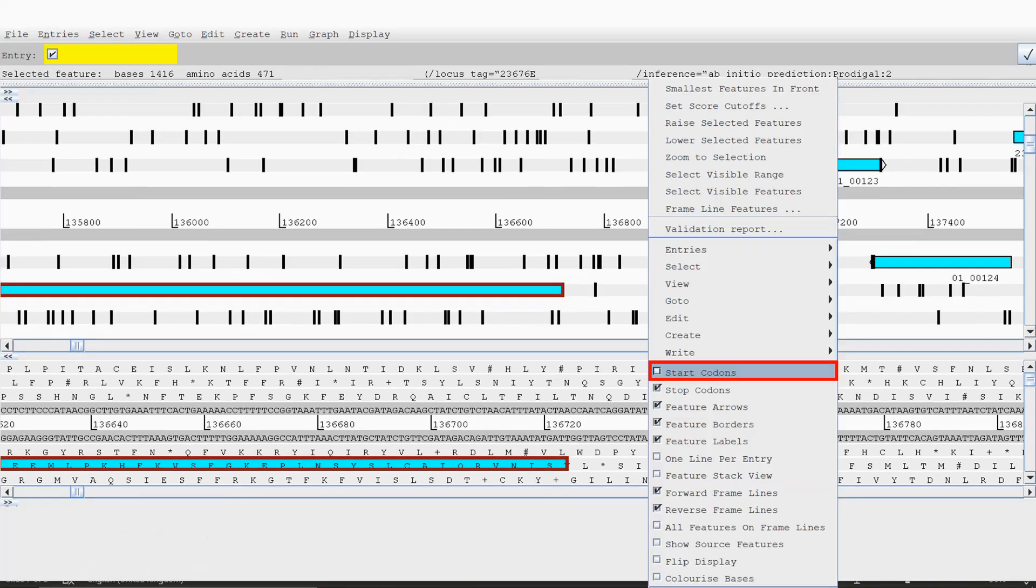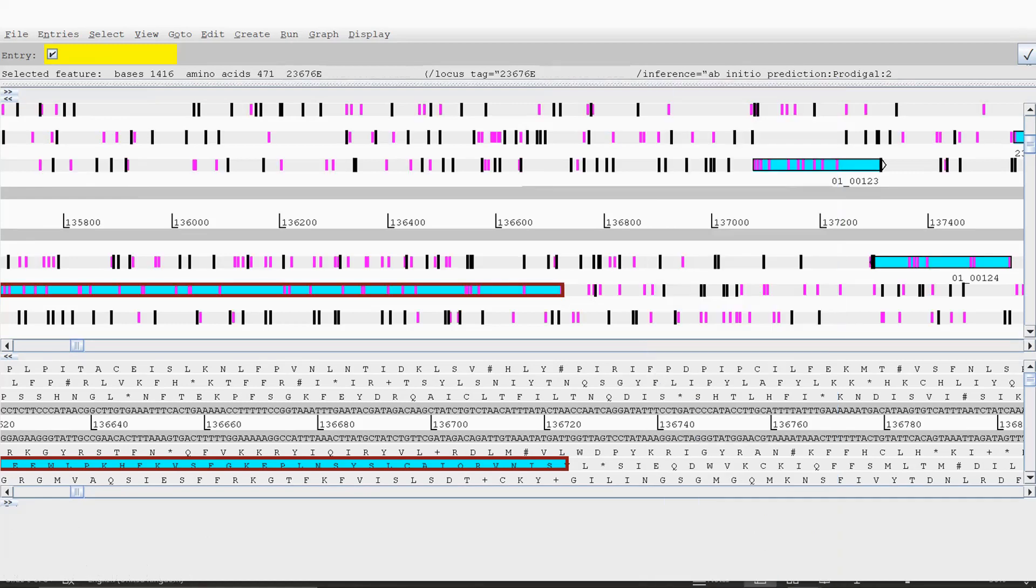If you right-click on one of the genes, it'll bring up a window like this, and then you'll be able to click start codons. Here you can see the start codons are actually highlighted in this sort of purplish color here. You can see the TTG is here in this particular image.